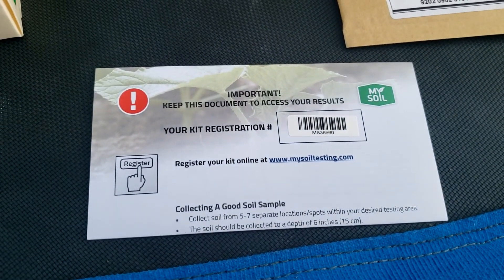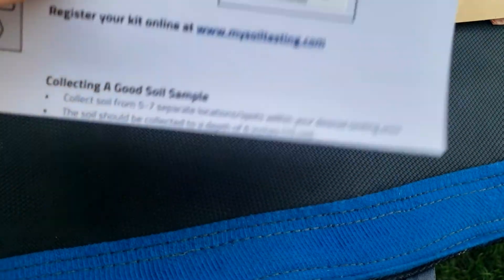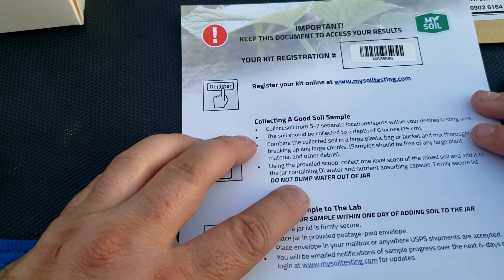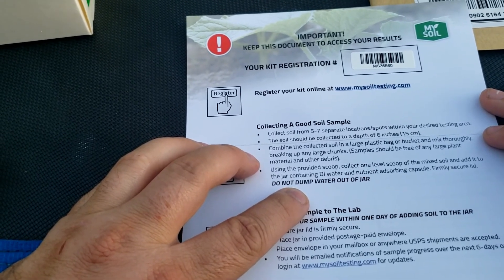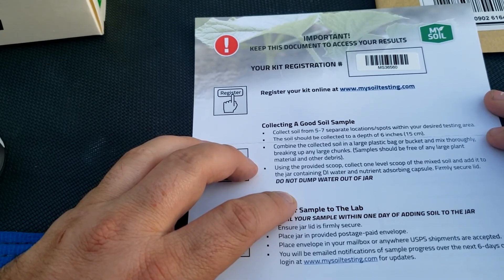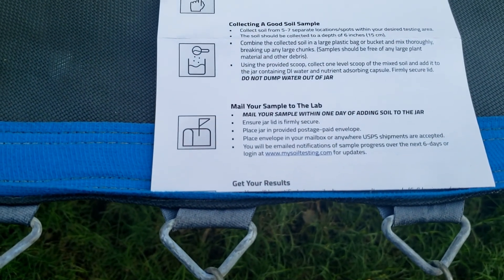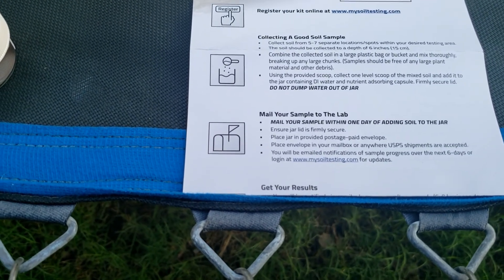We're going to fill that out online and show you in a second. Then it says to collect soil from five separate location spots within your desired testing area. The soil should be collected at a depth of six inches, combined in a large plastic bag or bucket, and mixed thoroughly, breaking up any chunks. Samples should be free of large plant material and debris. Using the provided scoop, collect one level scoop of mixed soil and add it to the jar containing DI water and nutrient absorption capsule. Firmly secure the lid and do not dump the water out of the jar. After that, mail in your sample within one day of adding the soil, place the jar in the provided postage envelope, and put it in your mailbox.